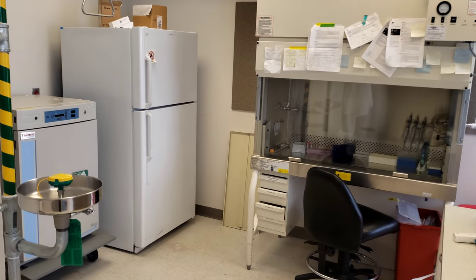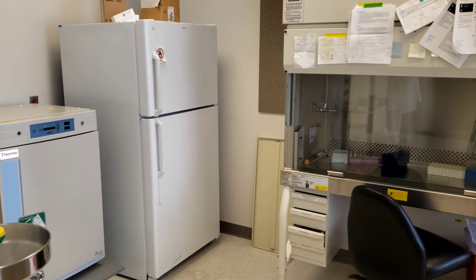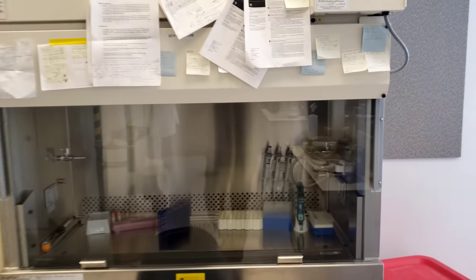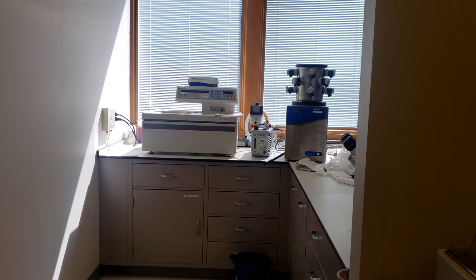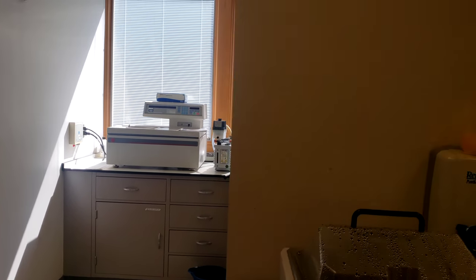So this is our second lab. We have a biosafety cabinet and an incubator for cell work. In the back over here is an ultracentrifuge and a lyophilizer for freeze drying things.